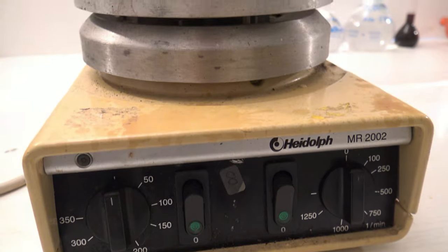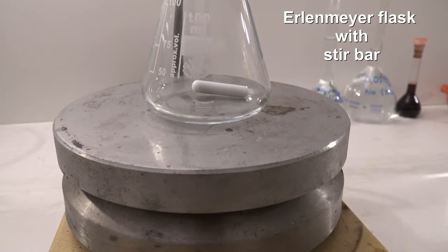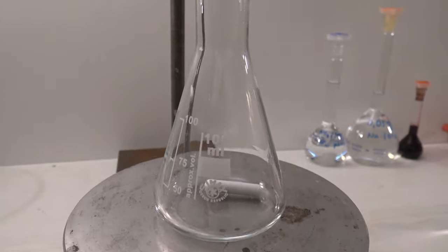For the titration, an Erlenmeyer flask with a stir bar is placed on a magnetic stirrer. Over the flask, a burette is placed.